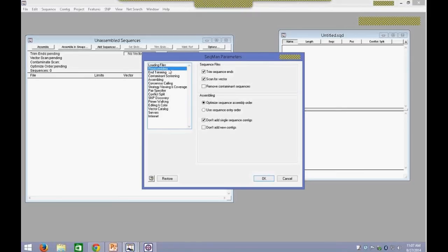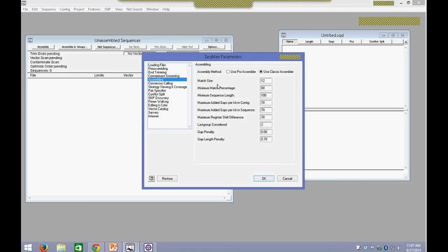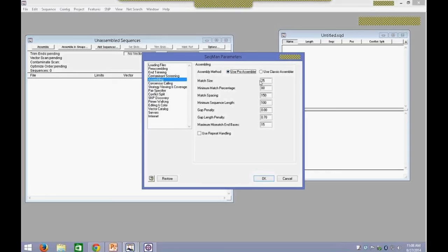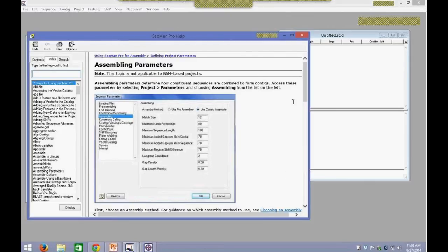We have some pre-assembly options including default trim sequence ends, scan for vector, and you can also adjust end trimming parameters. The more important one to focus on is assembling. This is where you'd choose the type of assembler — we have Pro Assembler and Classic Assembler. For all assemblies, we recommend using the Pro Assembler. In the Pro Assembler, you can further change the match sizes, minimum match percentages, and other advanced options. However, we do not recommend that you change these, as they are thoroughly QA'd and are the best parameters for most assemblies. You can click on the question mark at the bottom of the window to get more guidance on what each parameter does.